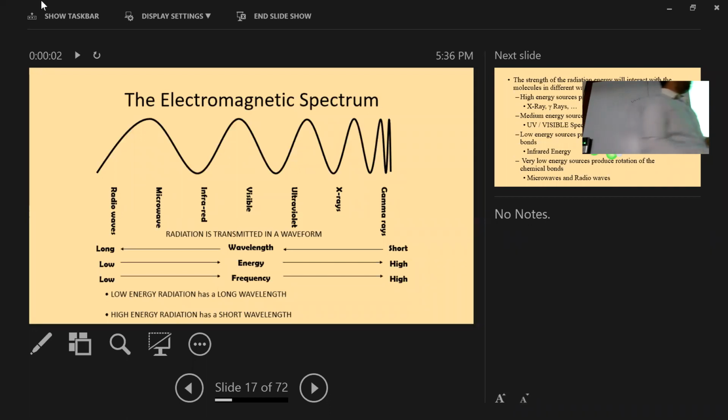That means if we give this ultraviolet light, one electron can eject from this aniline molecule if we give 2 photons. You are familiar with the photon, one quanta. Take a wavelength of 266 nanometers, one wavelength of light.